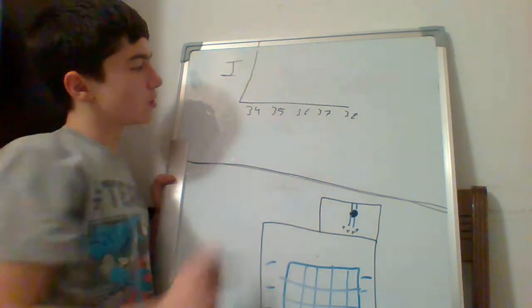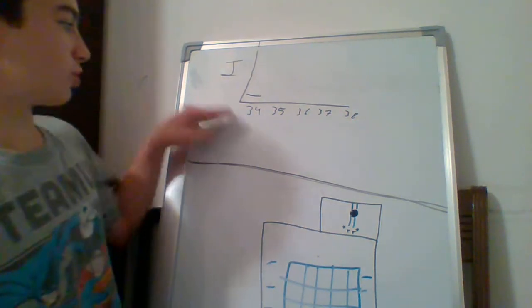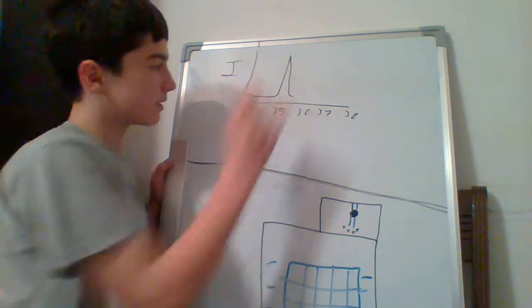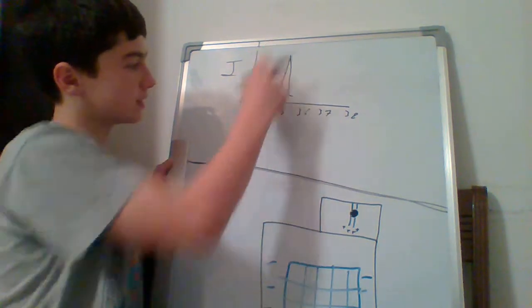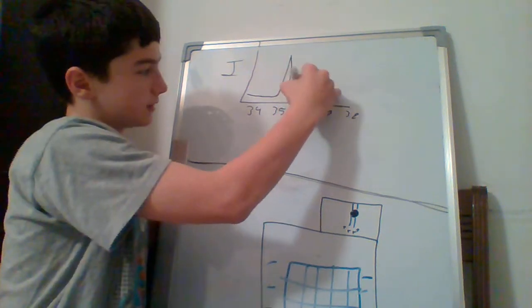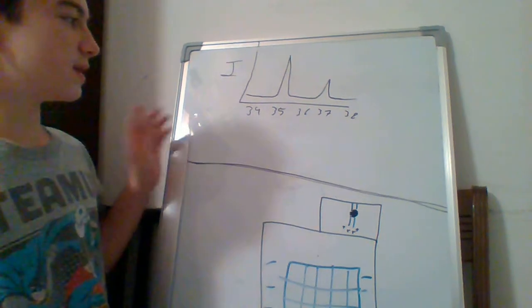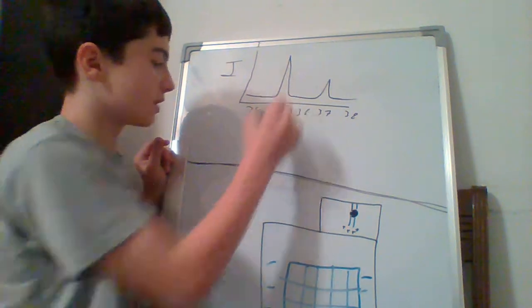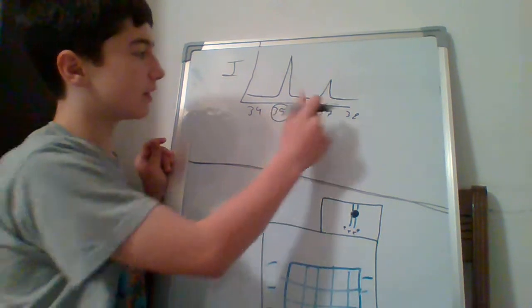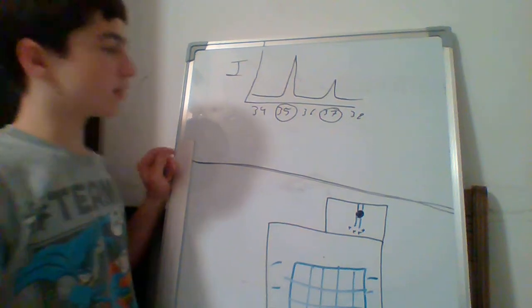Okay, so you can see that there's nothing shown for the isotope of 34, chlorine 34, but here we have a steep, tall line. Then we continue: 36, nothing, 37, a little bit, and 38, nothing. So you see, the only isotopes given in that sample are 35 and 37. So I want to know which one we have more of, 37 or 35?